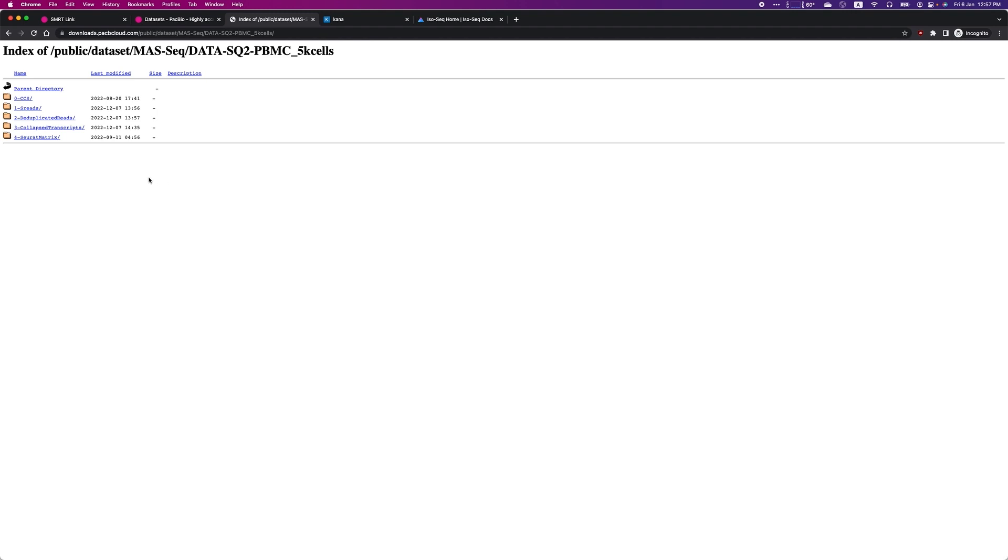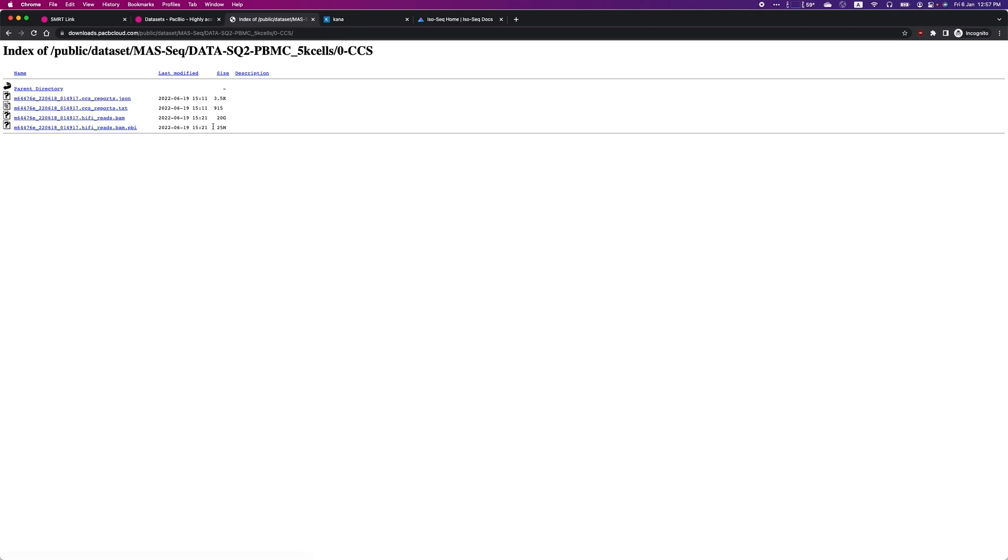In the dataset folder, you will find various data associated to different stages of the analysis workflow. To start analyzing from scratch, you can download the HiFi reads BAM file from the CCS folder.